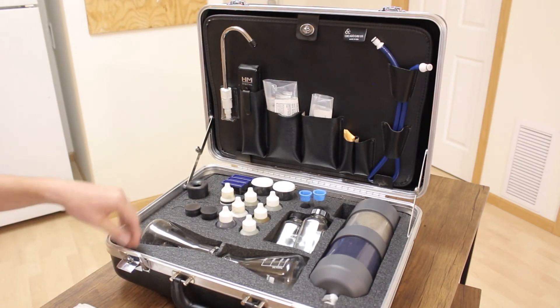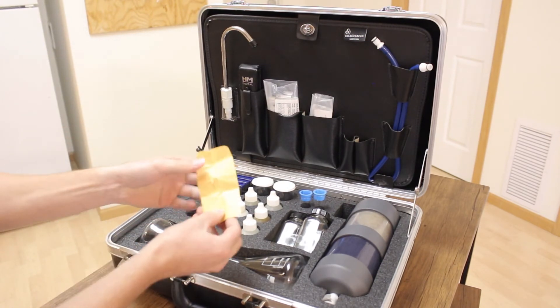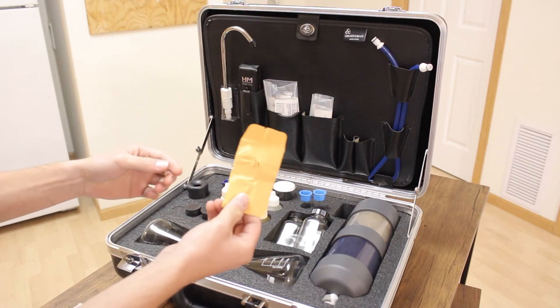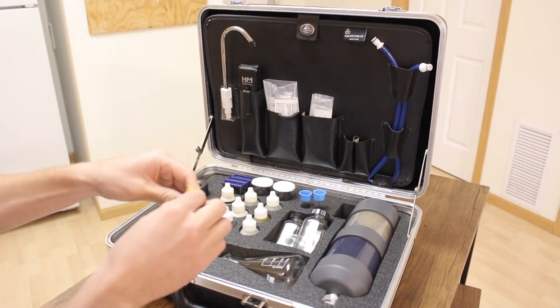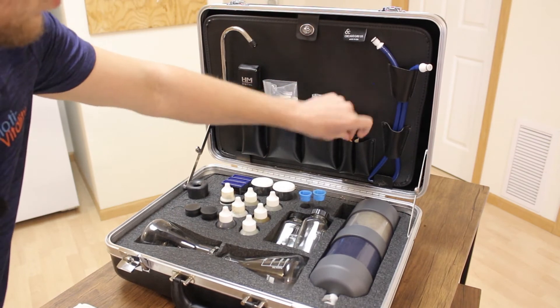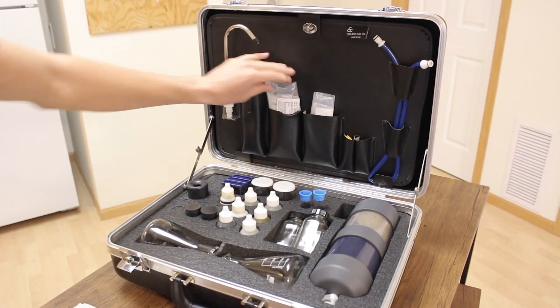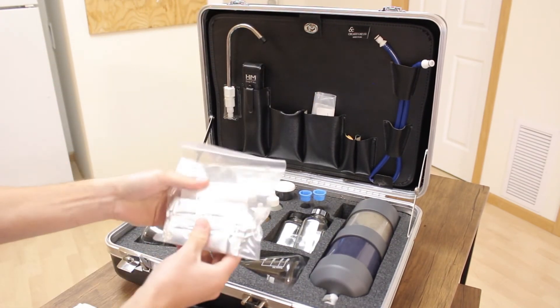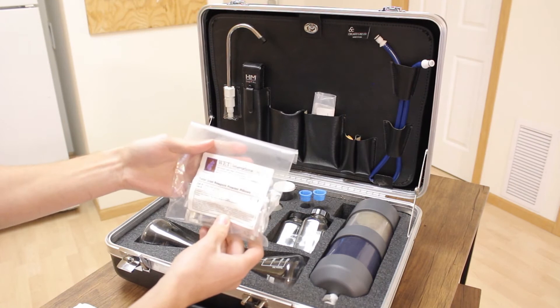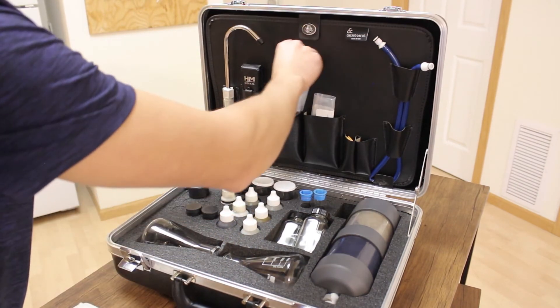What I like about this kit is it does have those locks — each kit comes with a little yellow package that has the keys inside, so if I want to I can put these on my key ring and lock my case. What also sets this kit apart is that it comes with all of the nitrate and iron pillows, which is pretty nice — you shouldn't have to restock for a while.